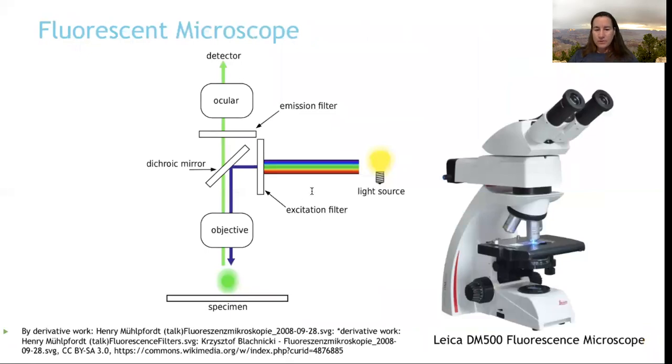Fluorescent microscopes. So we were talking about fluorescent dyes and how they can take energy from a higher level like UV, and then they can transform that energy. They'll absorb that energy, and then they will reflect out a lower level energy that you and I can see with our eyes. So with fluorescent microscopes, we got an energy light source. It's going to send in a higher level energy like UV or blue, that's over there on the higher energy spectrum.